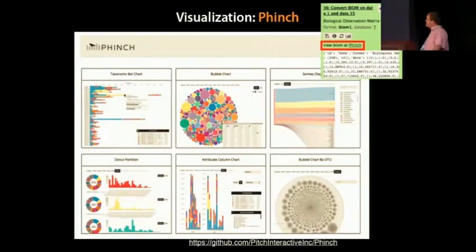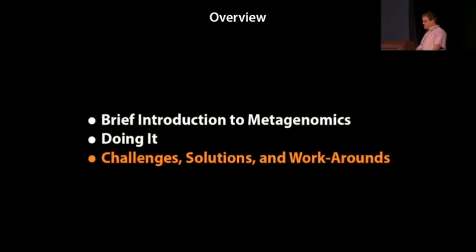For visualization, one really nice visualization tool is Phinch. You can view your biom data interactively at Phinch.